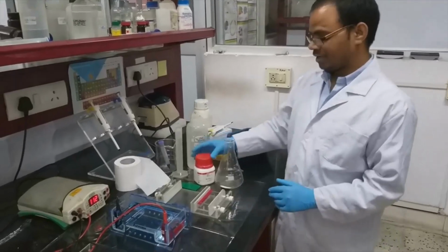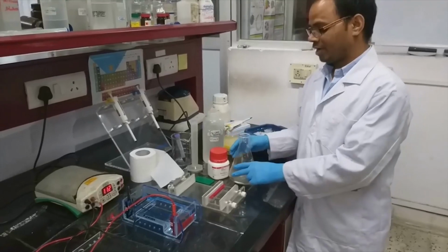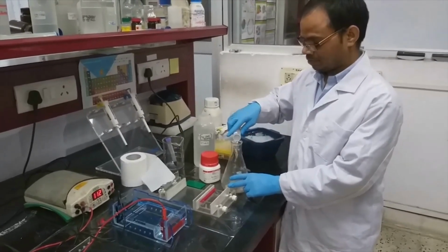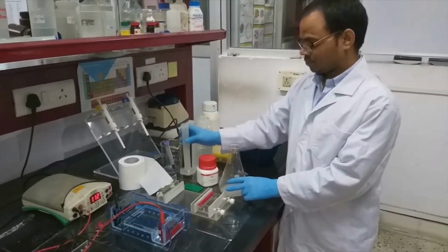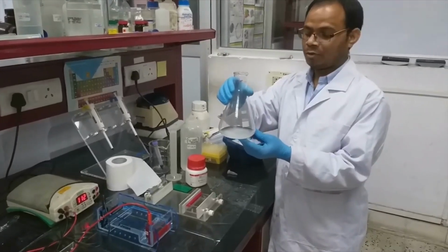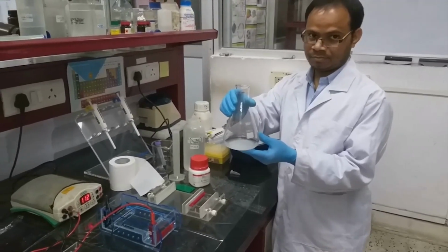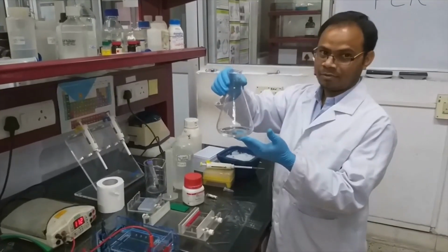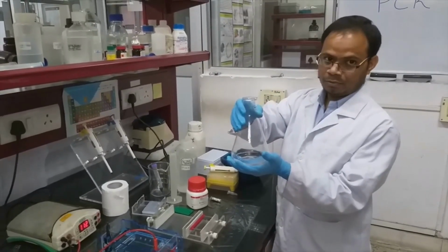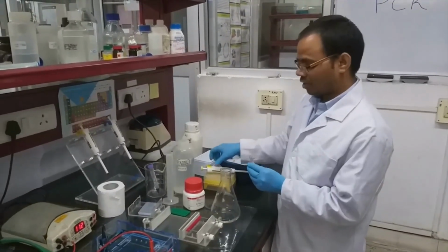Once the PCR reaction is completed, we have to analyze the results for amplification. For that, we need agarose and TAE buffer. First, we have to weigh the agarose and mix it with the TAE buffer. It will not dissolve easily, so we have to heat it in a microwave oven until it dissolves. Now the agarose has dissolved in TAE buffer. We have to let it cool down to 50 degrees Celsius.